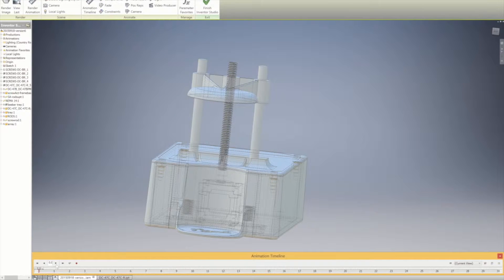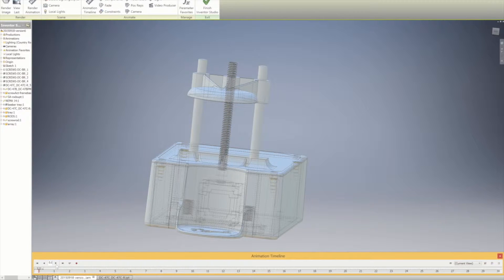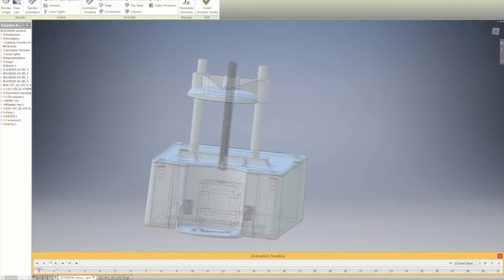We're going to see an animation that basically simulates this platform moving up and down about negative 2 inches, just to rest just above the beaker so that splashing of the acid is kept to a minimum and contained in that area.